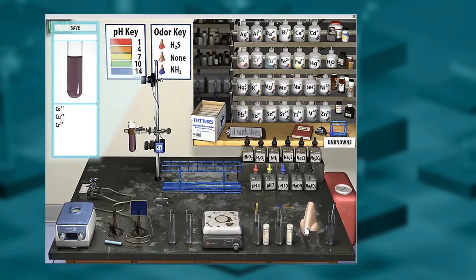measure the pH of the solution, pH of the vapor, smell it, stir it, and add any of these 11 reagents in any order, any combination that I want, and we're going to show you the real outcomes.